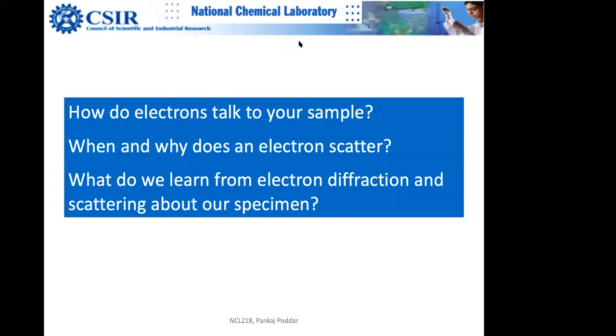So what property of homogeneity, because you would like to ask. When you consider photons, photons are very sensitive to subtle changes in the refractive index. So whenever they see a change in the refractive index or dielectric constant, there will be scattering. What about electrons? Electrons will scatter when there is a change in the Coulombic potential. When I say Coulombic potential, I'm basically considering the overall potential coming from the positively charged nucleus and the electrons surrounding it, right?